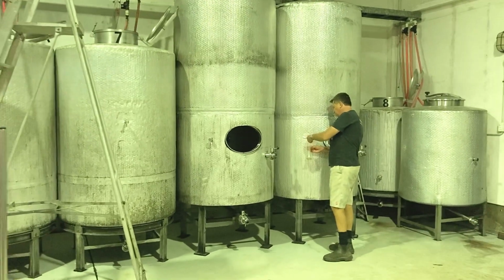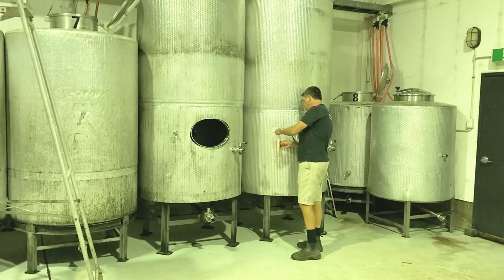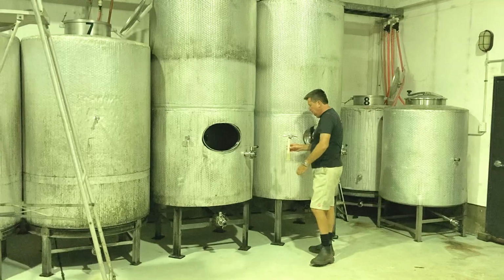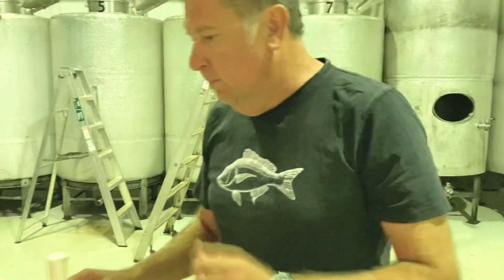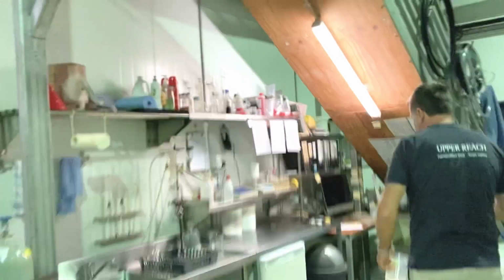Vintage, and we're going to take a Baume reading. We're going to monitor our ferment. So you can see Derek taking a sample here from the tank. It's Chardonnay fruit. We picked it about a week ago now, and it was cold settled for about 3 days, and then it's been fermenting for another 3 days.